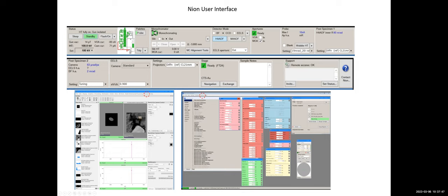And then there are some other parameters. We rarely change those, but it's good to know that those are important. If somebody happens to change them to the wrong value and you never even look at this, you will get into trouble. So I want to show you the set outer. We define outer as 30. And then for a patch, we use a negative value of negative 1,000. And for order 5, we use 45. And for the patch, it's a negative 1,000. So normally, you only change this required resolution. And this should be kept the same. So you can take a note on that.